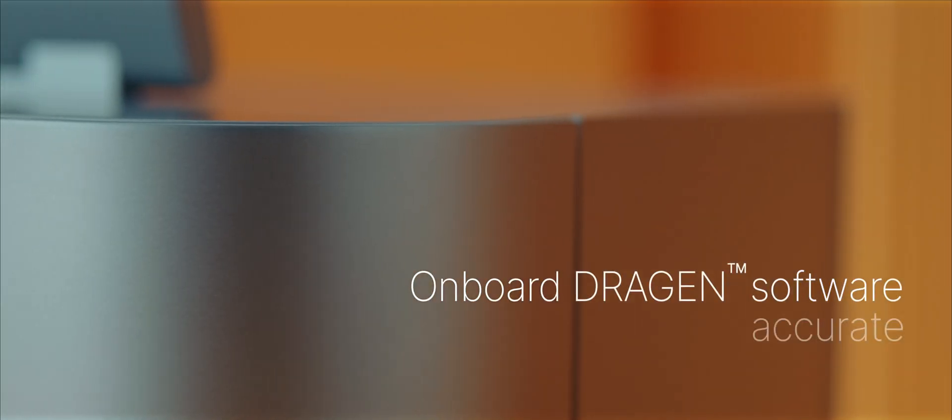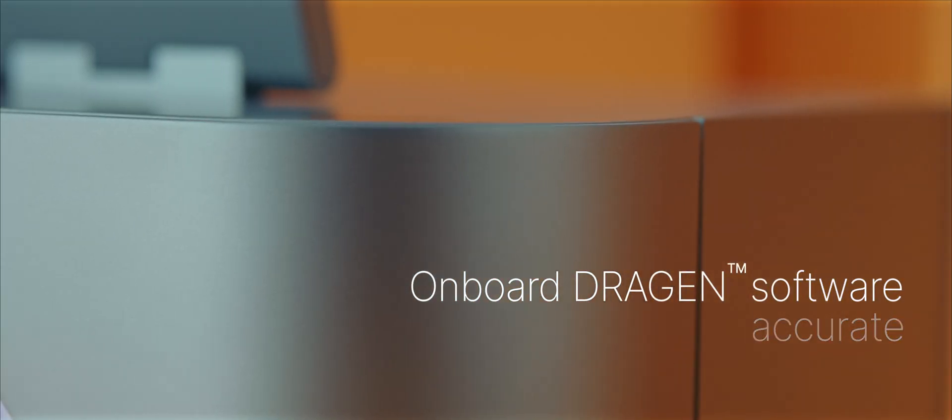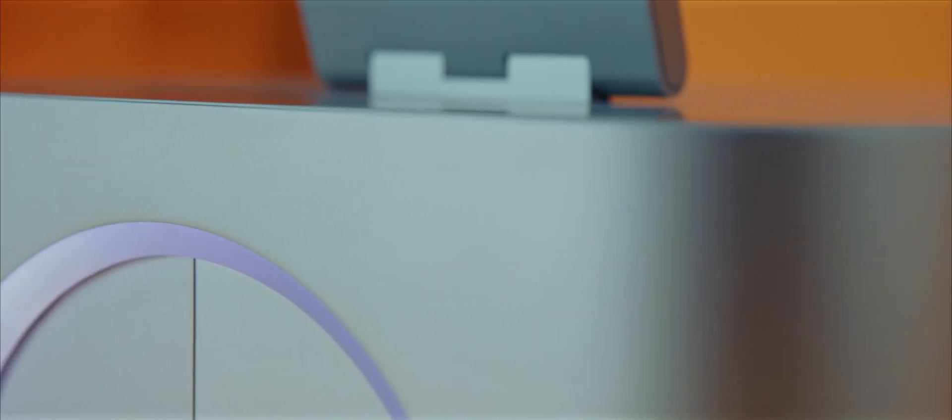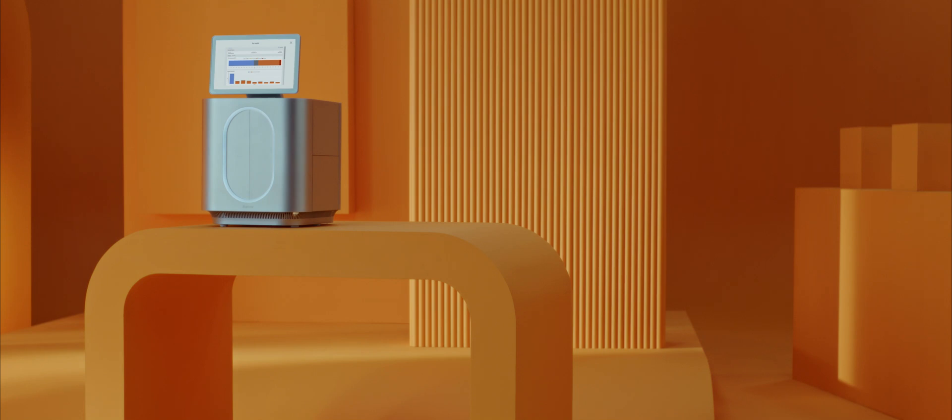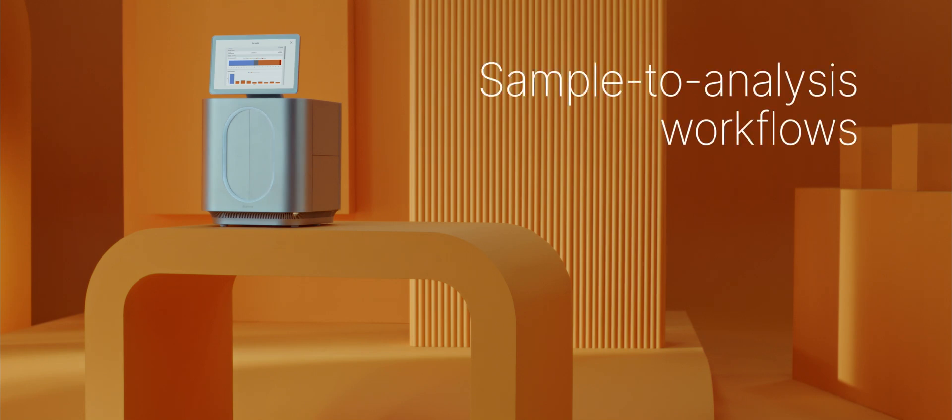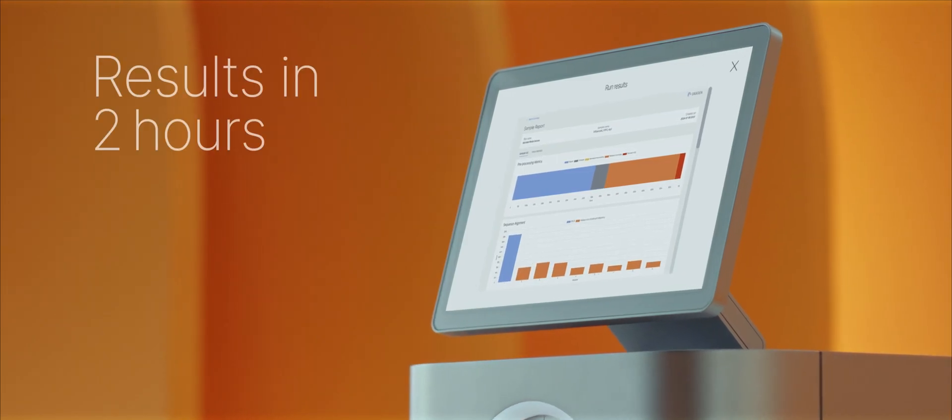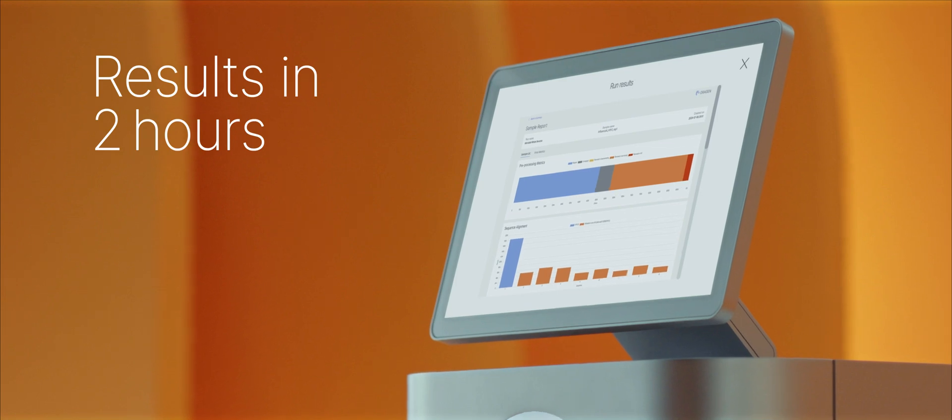Onboard DRAGEN offers accurate, comprehensive, and efficient data analysis. Data analysis has been simplified with sample-to-analysis workflow solutions, generating results in two hours.